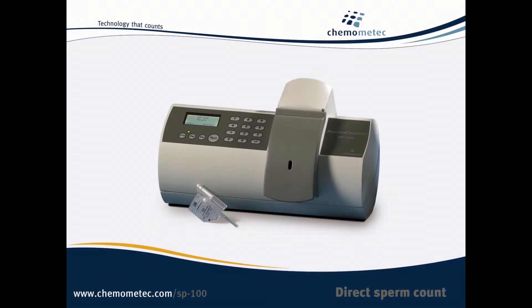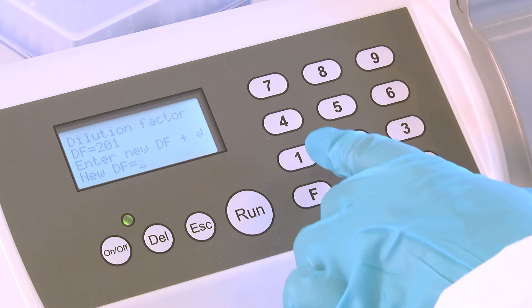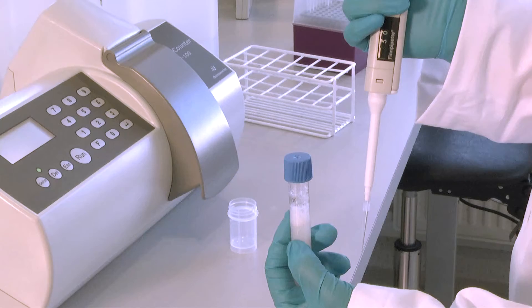To evaluate a stallion ejaculate, select a dilution factor of 101. Press F0 on the Nuclear Counter keypad, type 101, and press ENTER to store the new setting. This dilution factor results in optimum accuracy in the range of 125 million sperm cells per millilitre to 500 million sperm cells per millilitre.